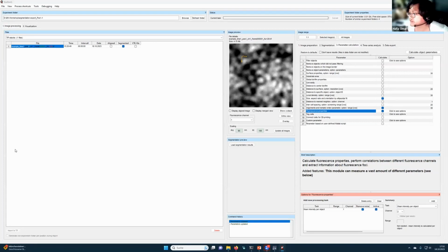Yes. Because in typical confocal microscopy, you do have fluorescence. You use, for example, reporter genes, or certain fluorescent proteins inside the cells. And we also consider multi-species work, like the question of co-localization. But one of the lights that we use in the detector is also the transmitted light, because we can look across the Z stack of the images and we also have the transmitted light. It's not just specific to the fluorescence. Somehow, can we extract extra information from the transmitted light, or does BiofilmQ only collect data from the fluorescence?